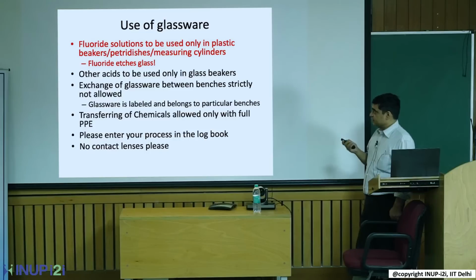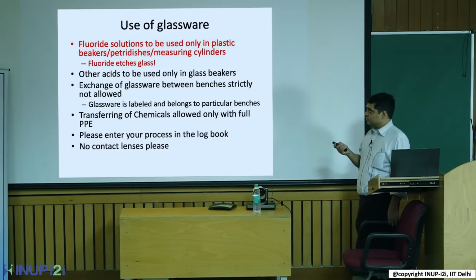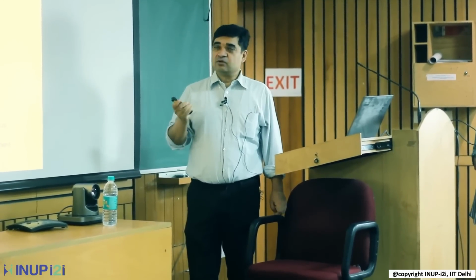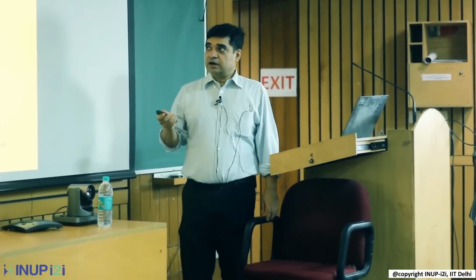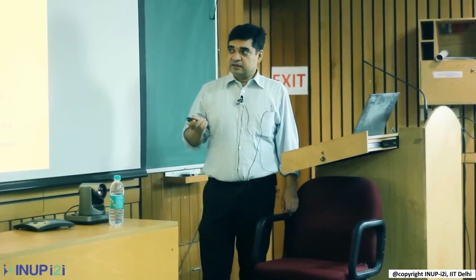Okay, these are some hazard symbols that you should be aware of. This is there on every bottle. E is explosive, O is oxidizing. What happens if you store E and O together? Boom, right? Similarly, you don't store flammable and oxidizing together.